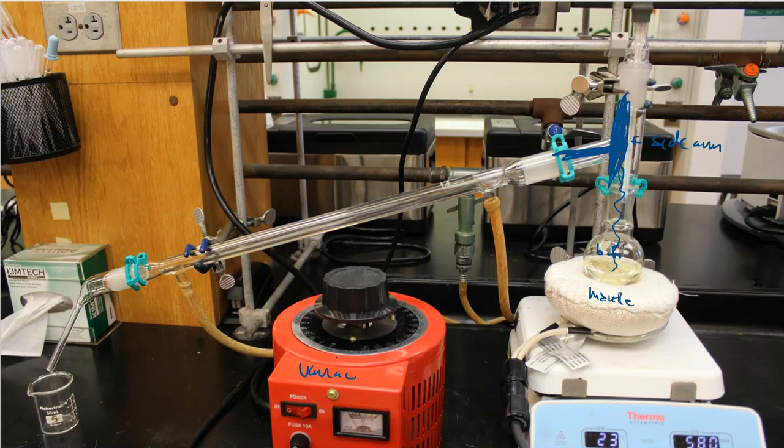As the vapors evaporate up, they're going to travel over and go through this West condenser that's here. As it goes through the West condenser, it goes through my drip adapter, and my drip adapter will direct it, drip, drip, drip, into a receiving flask over here to the left. All right, so that's how this process is going to work. Notice up here at the top, though, I also have a thermometer. This thermometer is going to help me keep track of the temperatures, so that I know what's distilling over at any given point in time.